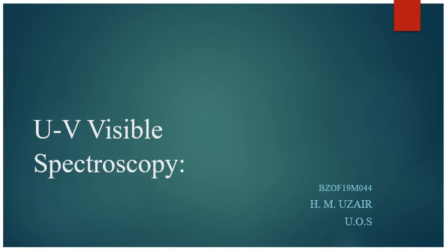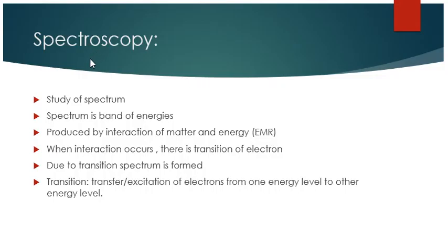Bismillahirrahmanirrahim. Today we will discuss UV visible spectroscopy. First of all, what is spectroscopy? Spectroscopy is the study of spectrum.